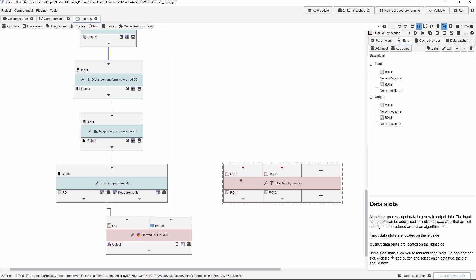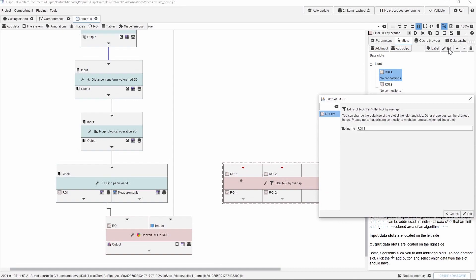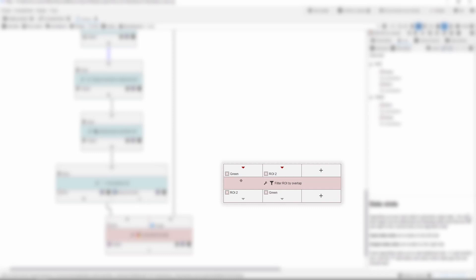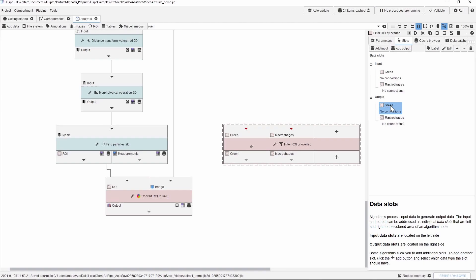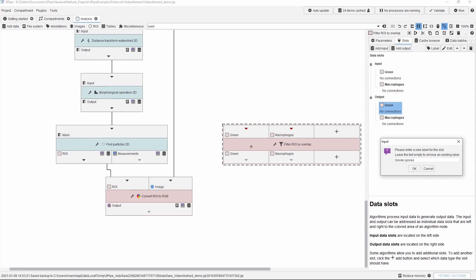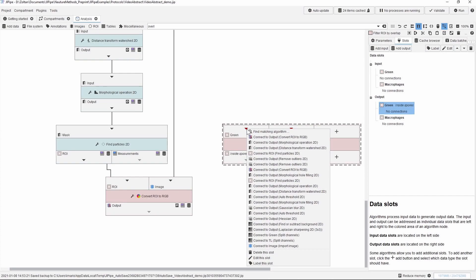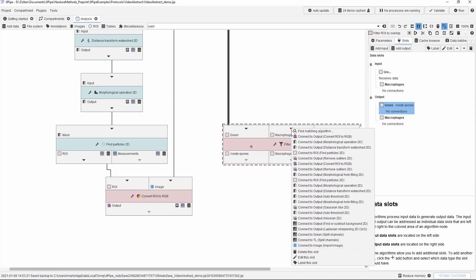All of the inputs and outputs can of course be fully customized. As an example let's first change the name of the ROI1. For this first we select the node, then we select the entry and then we click on Edit. This opens a new window where we have the chance to change the name — in this case we name it Green. After the confirmation, the updated node will appear on the workflow. Then we carry out the same steps for the other slot for the macrophages. We also have an extra tool to customize these slots using labels. Here we label those spores that overlap with the macrophages as inside spores. We can now connect the corresponding regions of interest, one from the macrophages and the other from the spores.